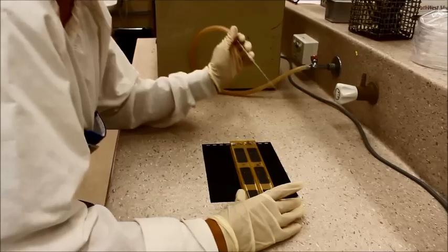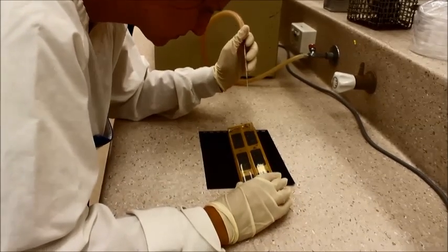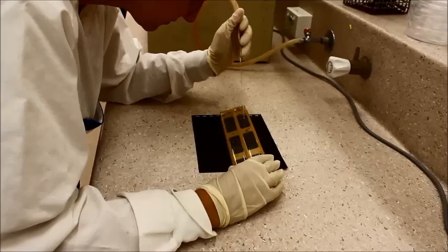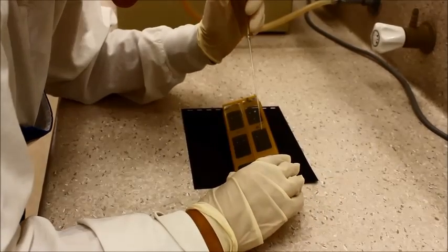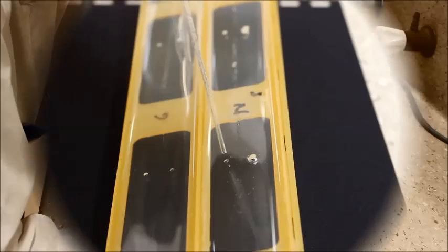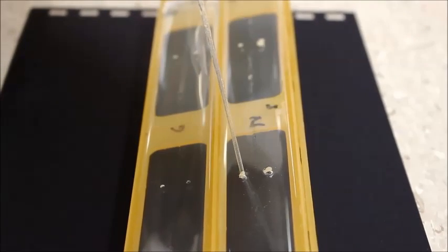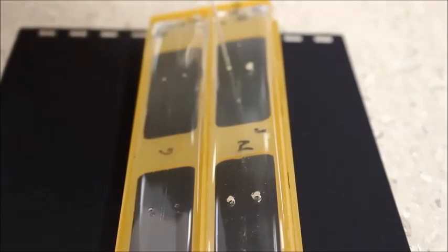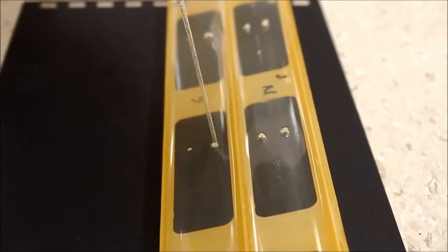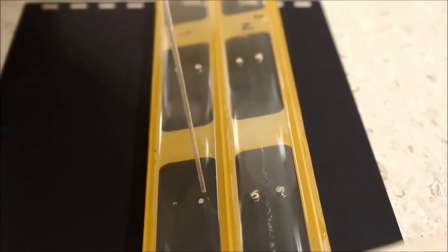Using a Pasteur pipette connected to a vacuum line, begin to remove the agar plugs from the wells. Do not remove the lines of agar from the trough just yet.